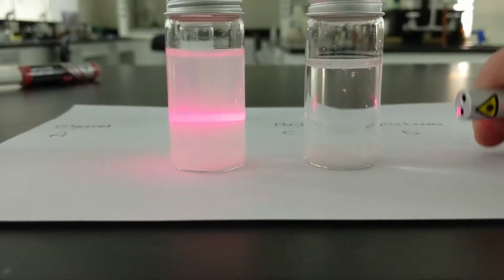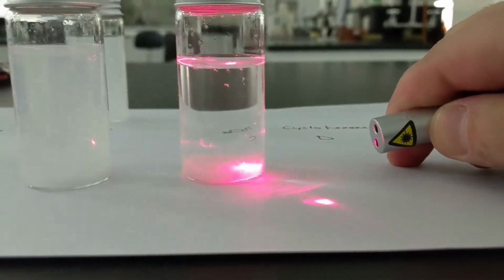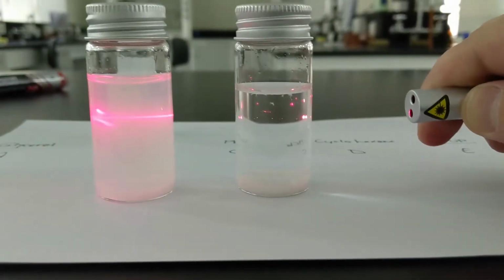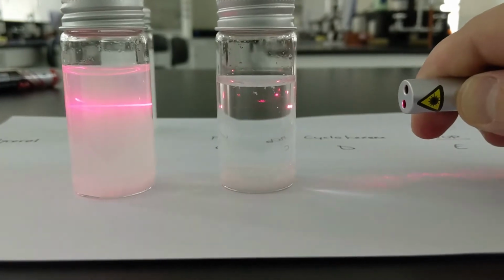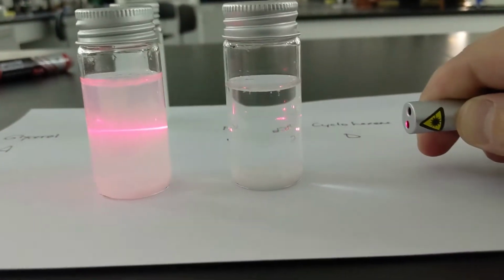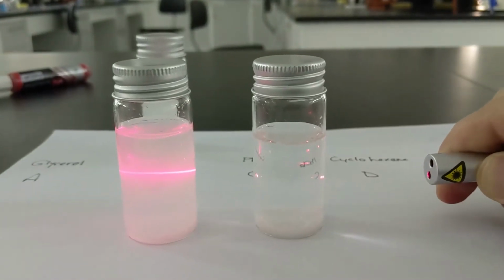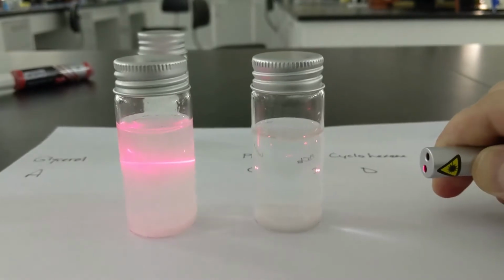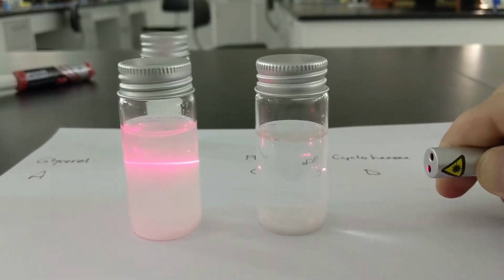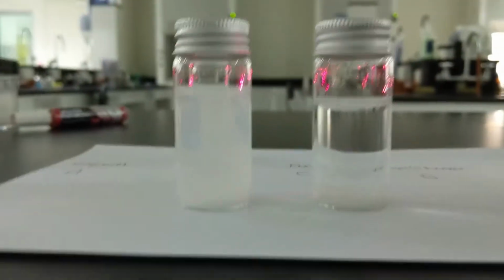Even in the one that I've let sit for 5 minutes, I can still see the light source going through. But in the one I let sit for a long time, it's not a mixture anymore. This would no longer be a colloid. And one way to really define the difference between a colloid or a suspension is if you let it sit for 5, 10, 15 minutes. Will there be sedimentation on the bottom, or will it stay the same?